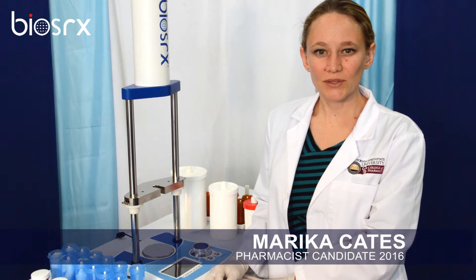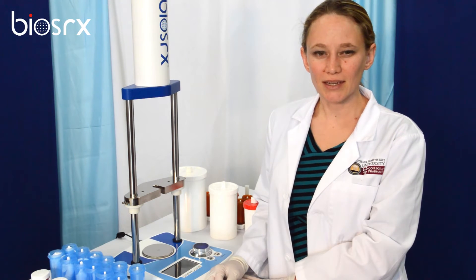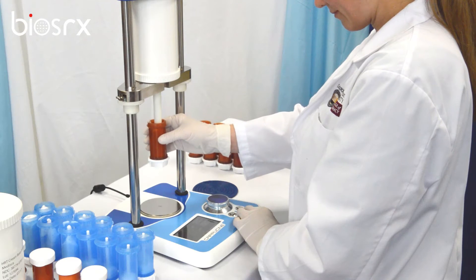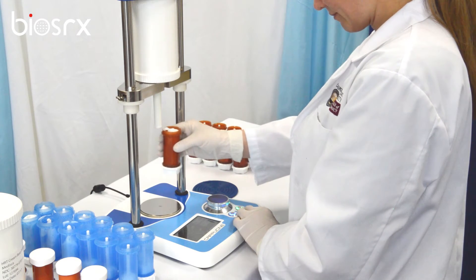This is Capucine, the world's first metered digital dispenser. It allows semi-liquid preparations to be transferred from EMP jars into smaller containers. Capucine is easy to use and features a minimalist design.